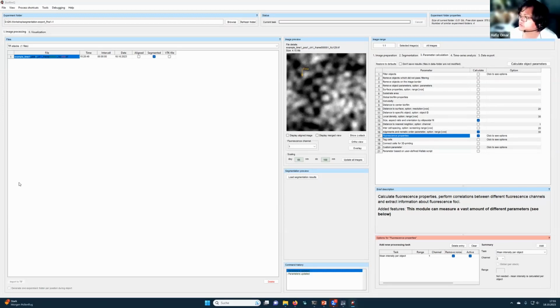We want to try certain time points. Of course, we don't want to do the whole time series, which will be big and take a few hours. But a pilot, a proof of concept, would be nice. Yeah. So the plugin is mainly meant for playing around with parameters, trying out whatever works, and then once it works, you can run a big pipeline. All right. Thank you for your questions.